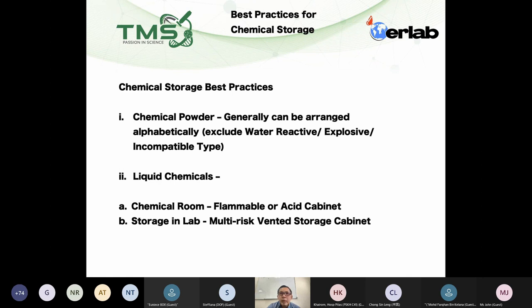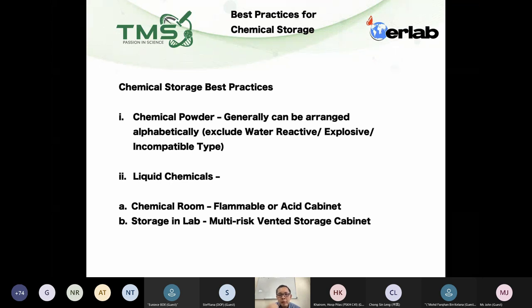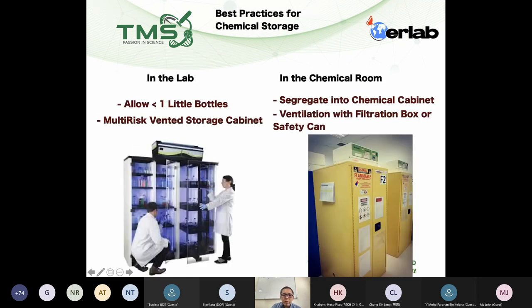Liquid chemicals tend to be more dangerous because even when you cover the lid, you still get some evaporation — especially with corrosive chemicals where you can see signs of leakage. So I will segregate liquids into two physical spaces: the chemical room and the working laboratory.